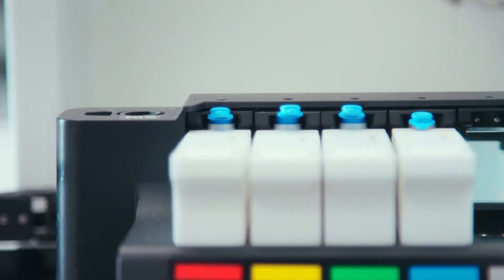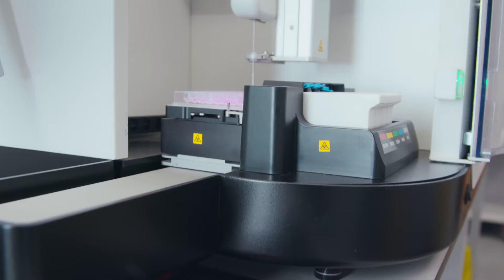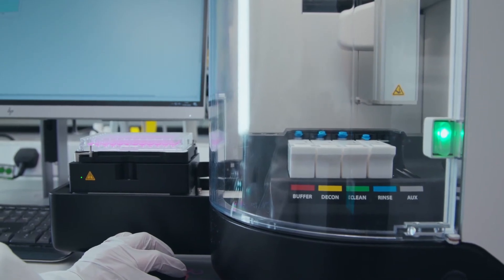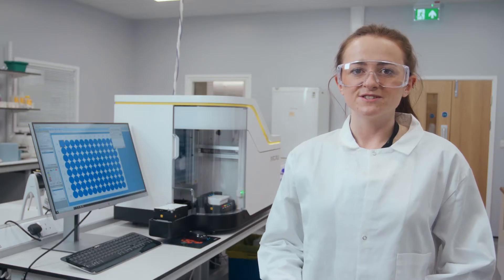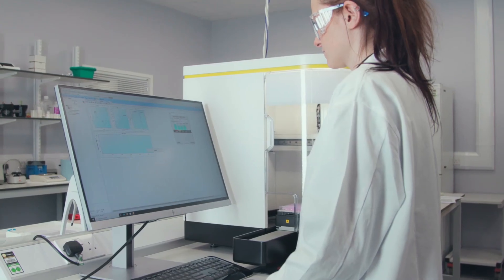An enhanced reinstation, which houses extended runtime cartridges, allows for unattended processing of multiple plates, and liquid level detection with user definable low level warnings to help ensure there are always enough reagents to complete the planned runs. The patented rapid micro volume sampling allows for the fastest acquisition time in the industry and can process a full 384 well plate in 20 minutes. The air gap technology enables rapid sampling across the plate and easy sample detection within the integrated IQ4Sight software. The minimum one microlitre sample volume conserves samples and reagent costs.